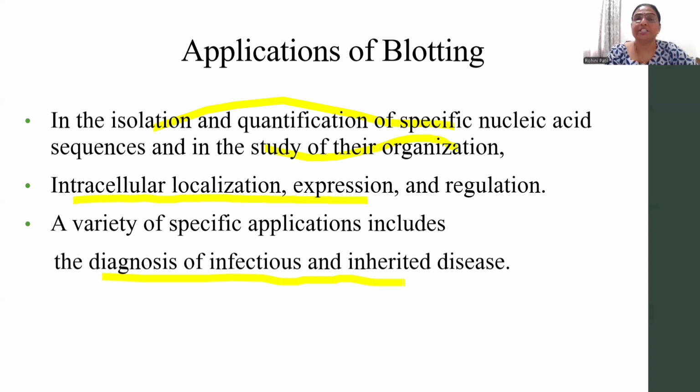If you want to study specific nucleic acids, you can study them. If you want to know the localization of the proteins, or the regulation and expression of the genes, you can also study that with the help of the blotting procedures. And also you can study infectious and inherited diseases.